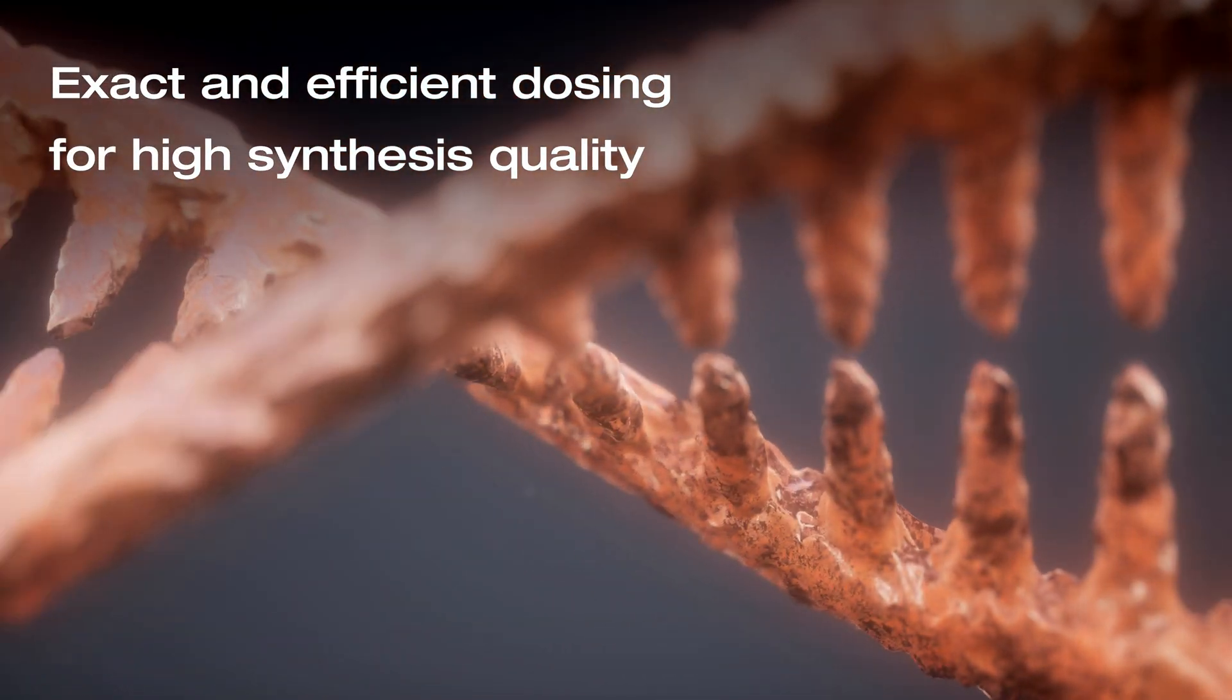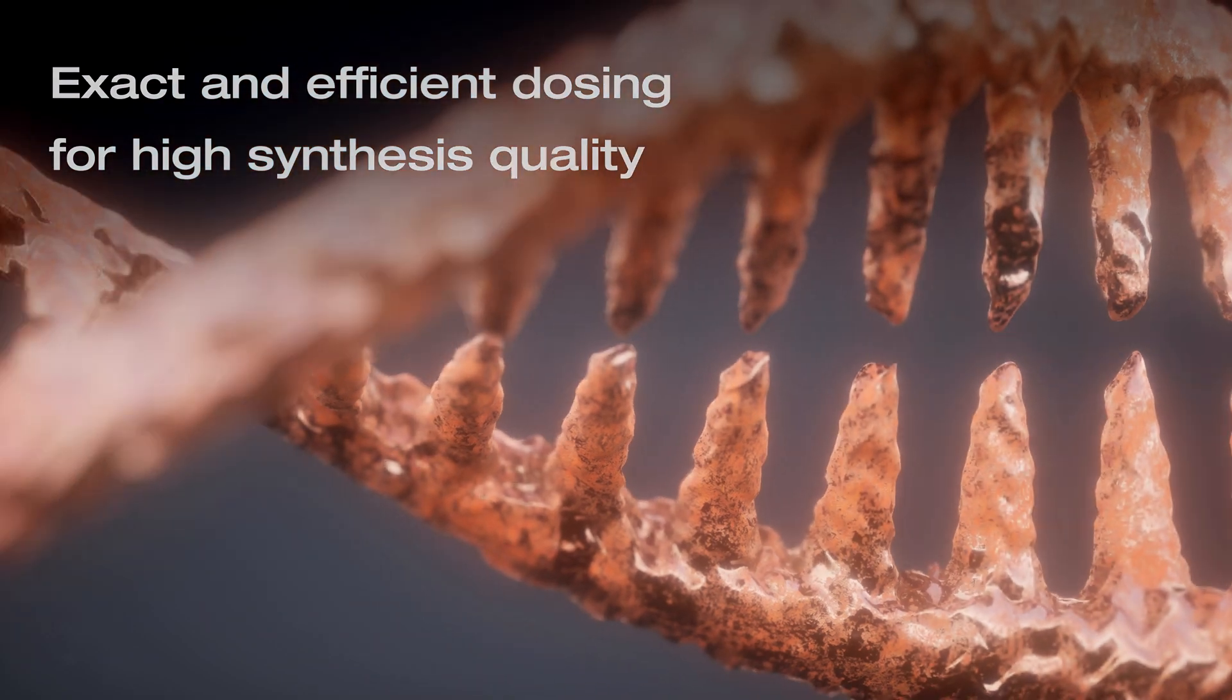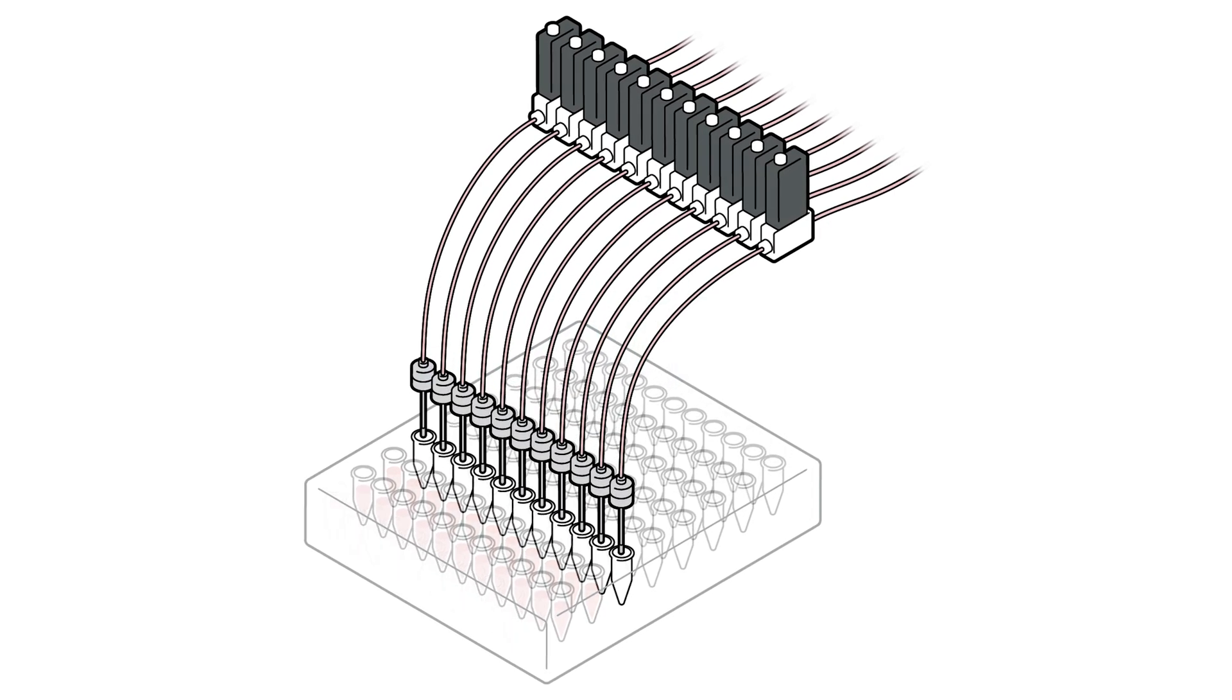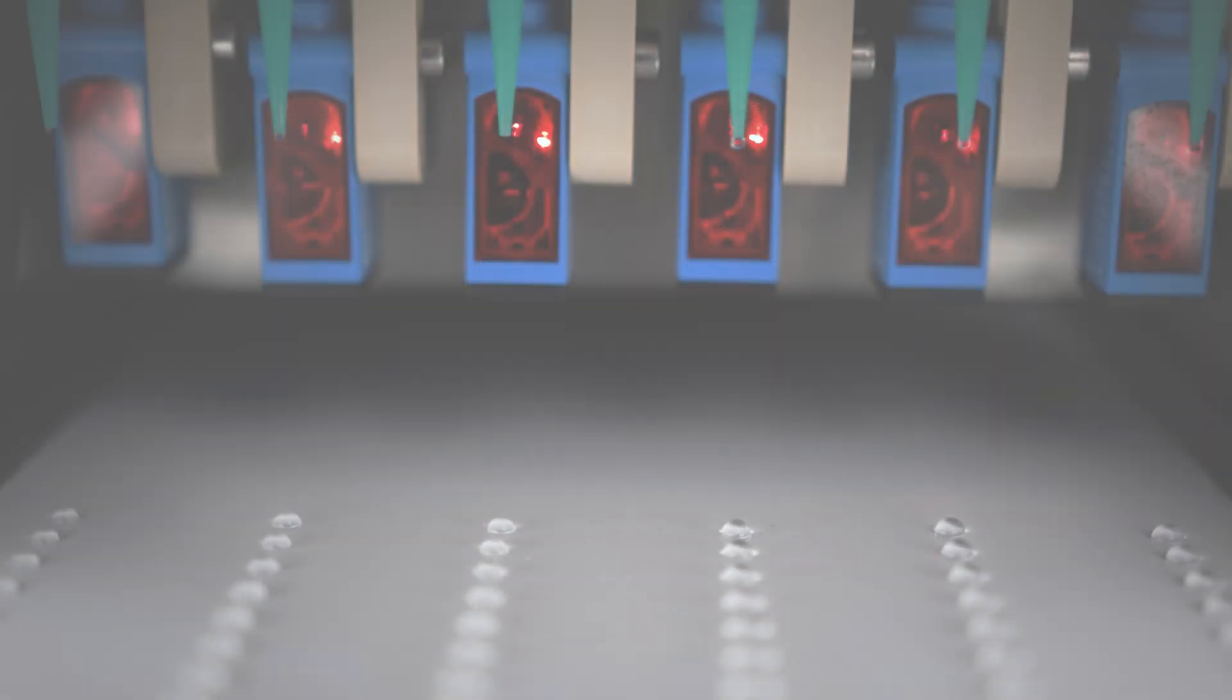The demand for oligonucleotides and artificially produced DNA in research is increasing. For example, the oligonucleotides are created via phosphoramidite synthesis. Various reagents must be dosed precisely in the microliter range.